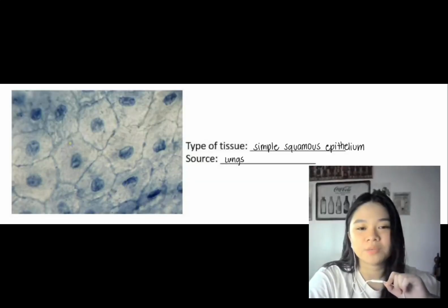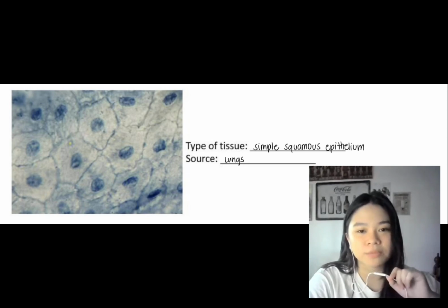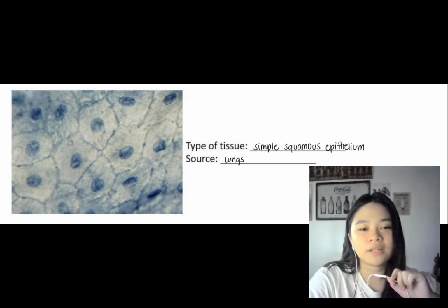The first specimen that we would be tackling is the human squamous. Squamous cells are thin, flat cells that look like fish scales, as you can see here in the photomicrograph. If you're wondering where this can be found, it is located in the tissue that forms the surface of the skin, the lining of the hollow organs of the body, and the lining of the respiratory and digestive tract. Also, the human squamous is an epithelial type of cell.